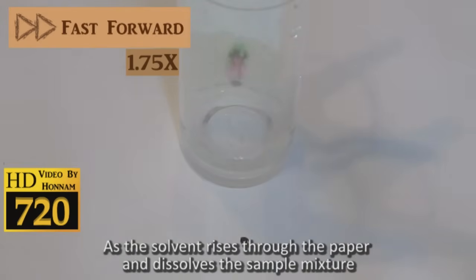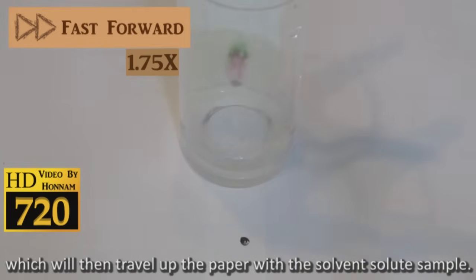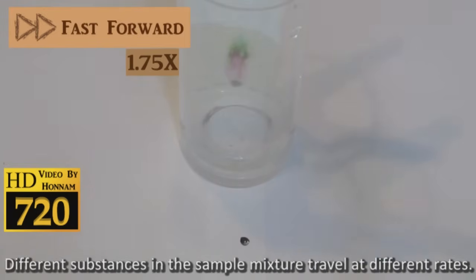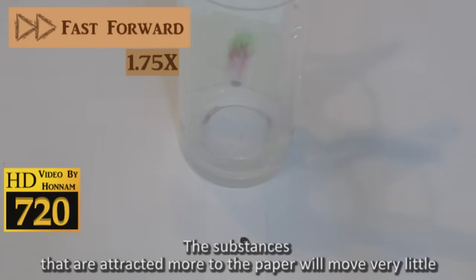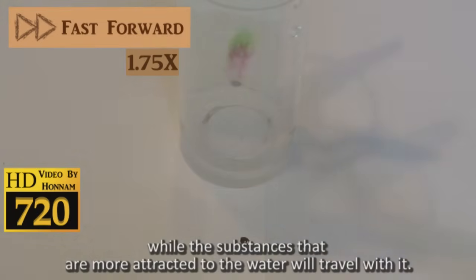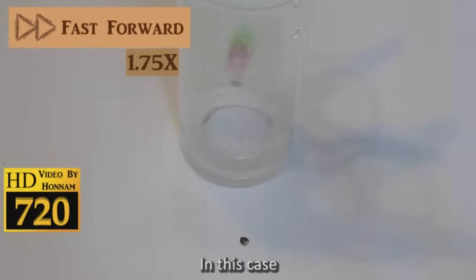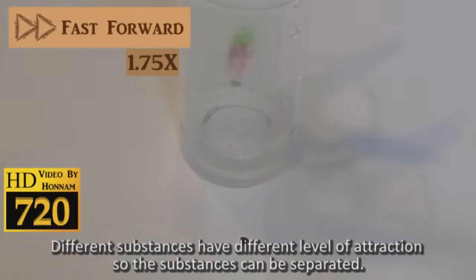As the solvent rises through the paper, it dissolves the sample mixture which then travels up the paper with the solvent. Different substances in the sample mixture travel at different rates. Paper is composed of cellulose, which is a polar substance. The substances that are attracted more to the paper will move very little, while the substances that are more attracted to the water will travel with it. In this case, different substances have different levels of attraction, so the substances can be separated.